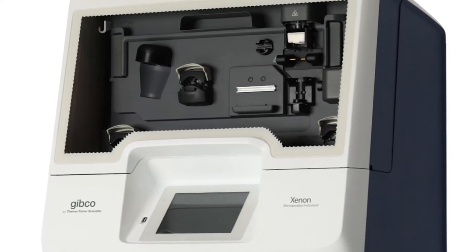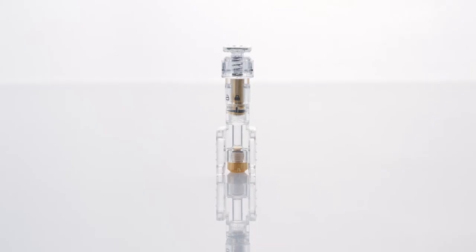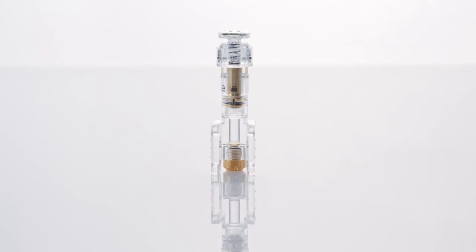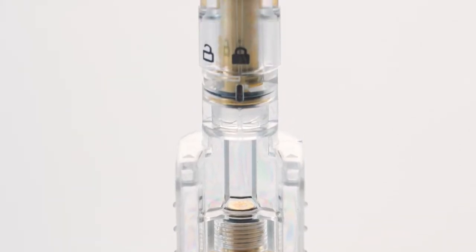The system uses single-shot and multi-shot single-use consumables to perform transfection. The single-shot format uses an electroporation chamber to process up to 100 million cells in a one milliliter sample volume.